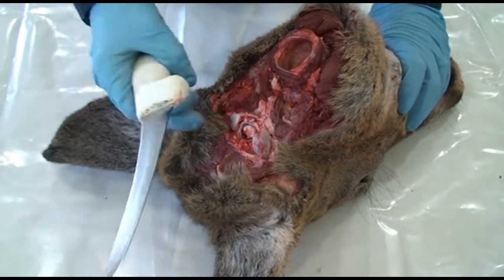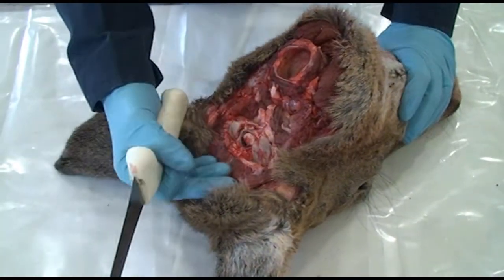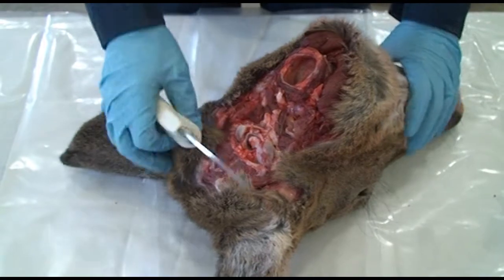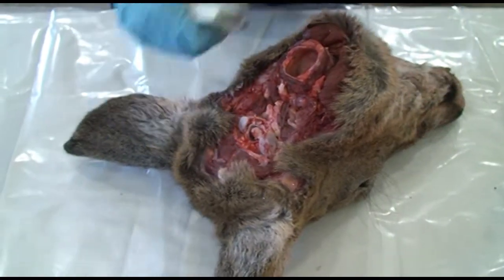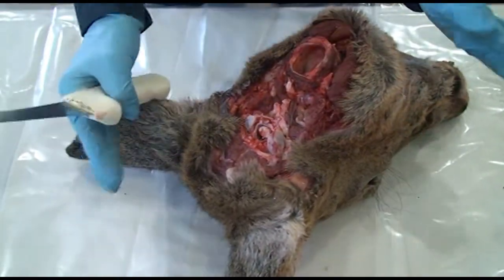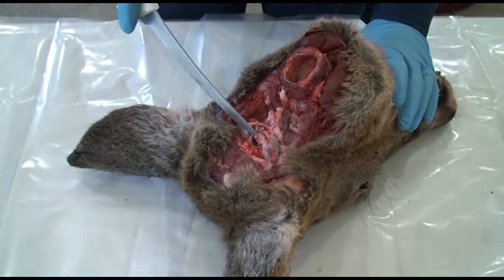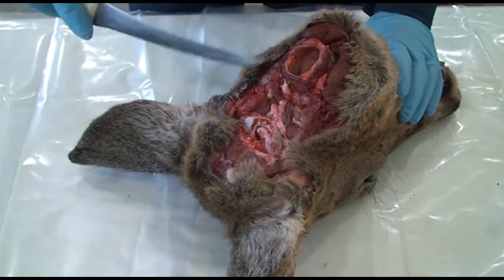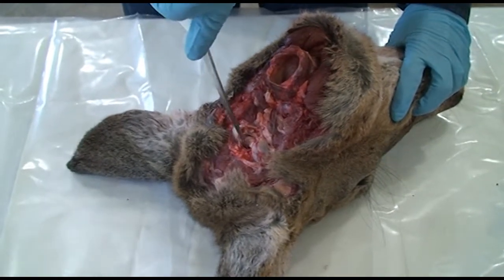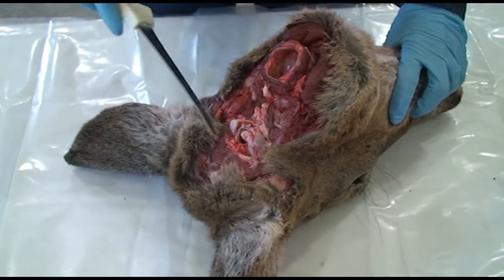Once you have that, then by whatever means you need to, you can go ahead and take the head off. You can even leave the body attached as long as you have it laying open, and you can get your sampling done. But the main thing is don't twist the head and pull it around and just let it tear. Also, you don't want to have the head really bent back and open when you cut that, because if there's a lot of tension on it at the time, the cord can slide back in there. So you don't want a lot of tension on the head when you cut that spinal cord, so that you have enough of it left to hang on to when you actually do the sampling.